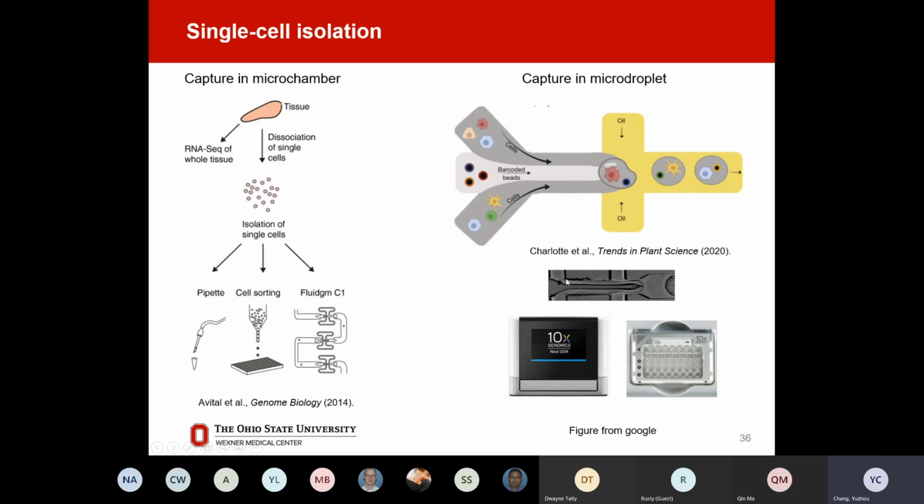The speed of this process is very quick, and this dynamic motion is captured by an ultra high speed camera. Actually, the speed of generating these droplets is about 10,000 per second. Yes, you heard that right. 10,000 droplets are generated per second. Wow, good to know. Yeah, it's the first time I heard about the detail. It's very fast.